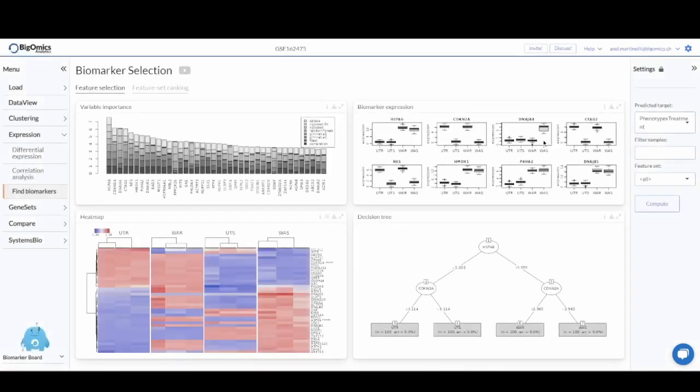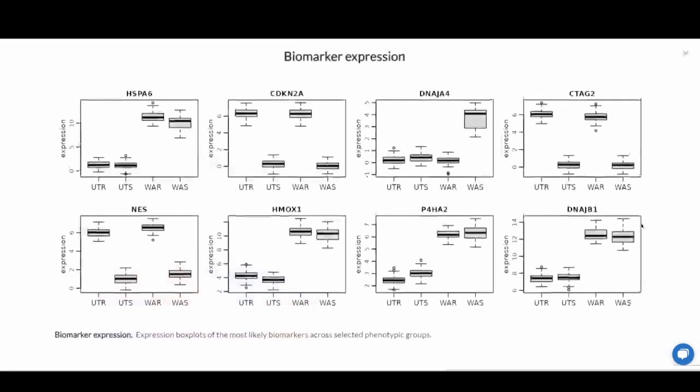On top of that, we have eight box plots that correspond to the most likely biomarkers.